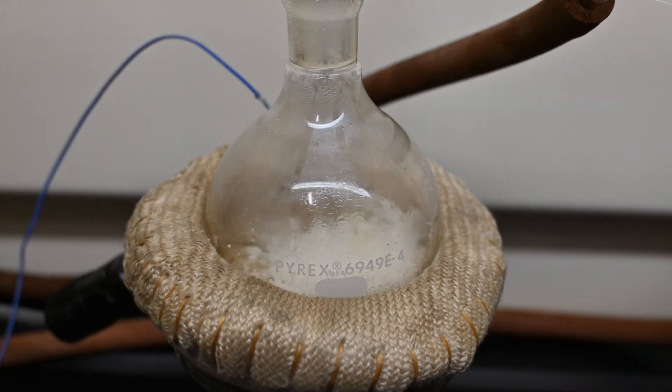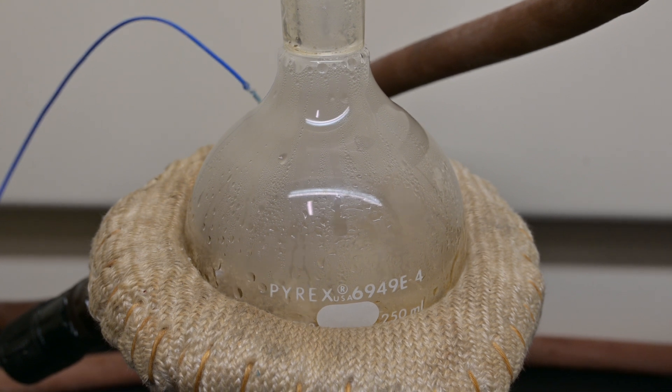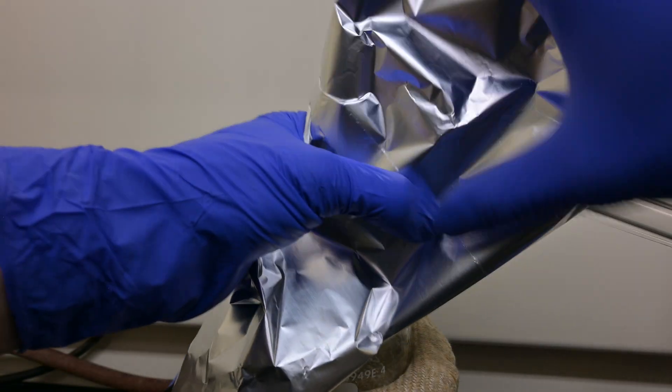Once hot enough, vapor started coming off the polystyrene. It was having some trouble coming over the distillation adapter, so I wrapped it with aluminum foil to keep more heat in.